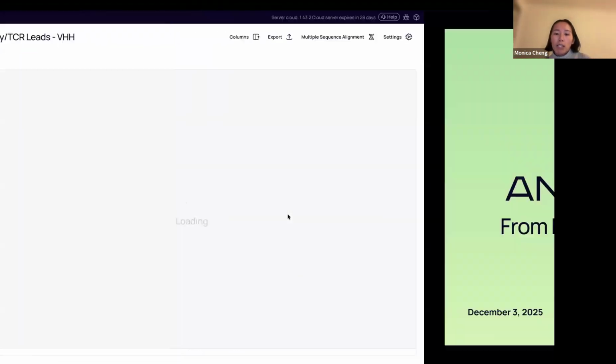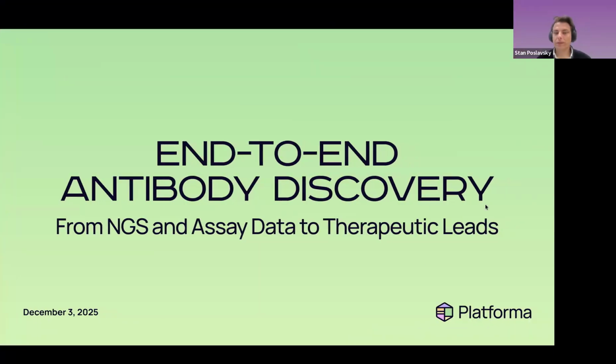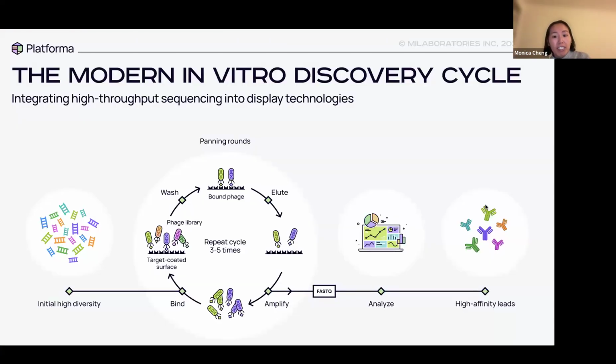Great. Okay, so let me go back to sharing the slides. Our software does have capabilities for in vivo. We can cover everything, but today we'll just be focusing on in vitro in today's discussion. If you're interested in in vivo, we'll have a separate dedicated section next month, or just shoot me a message if you want to learn more. And also feel free to drop any questions you have in the chat, and we'll get to them at the Q&A for today.